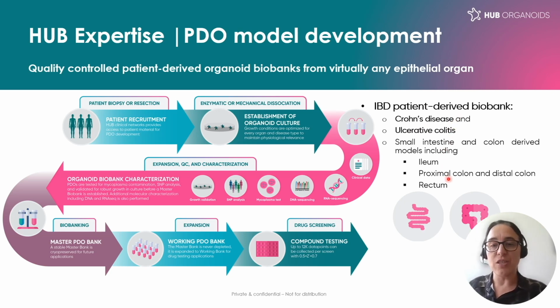And actually, we have generated organoids from different regions of the intestinal tract. So in this sense, we already have a nice collection of patients who have been SNP validated for risk loci for IBD, and also some transcriptomics to understand how well these organoids maintain some of the hallmarks of the disease.